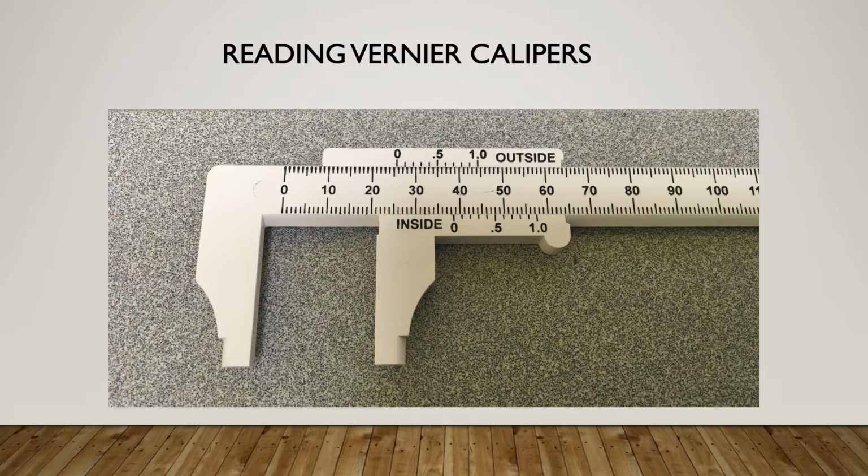But it is important when you go to CSE Pub to input your data for the lab. One of the things you do want to be aware of is I think it asks for the units of this diameter to be in centimeters, because your density eventually is going to be in grams per cubic centimeter for its final units. But this, remember, is measuring in millimeters. So you will have to do a conversion of the millimeters that you get from your calipers to centimeters that you're then going to put onto CSE Pub and use for your calculations later.